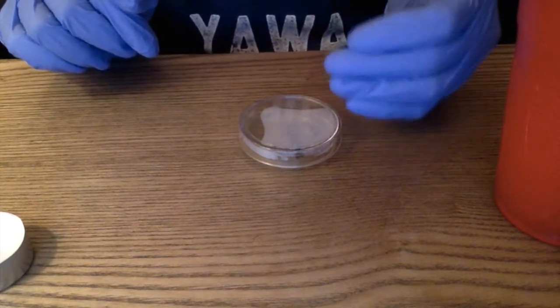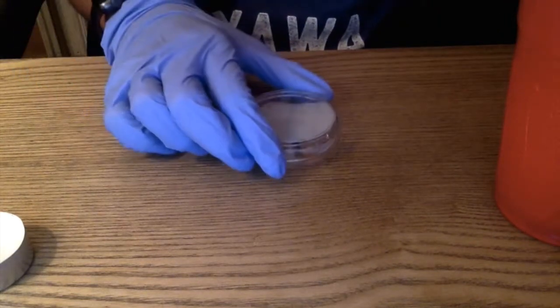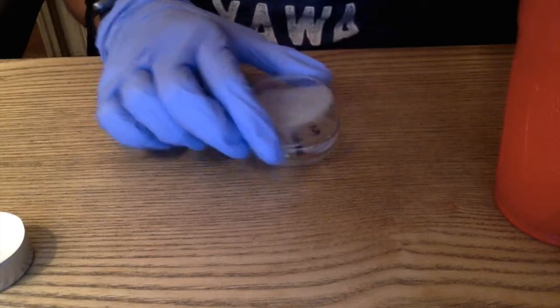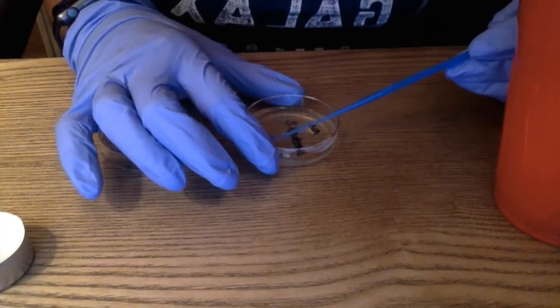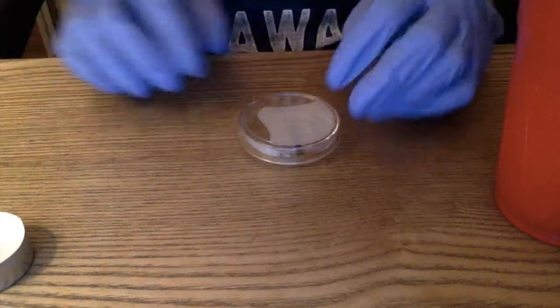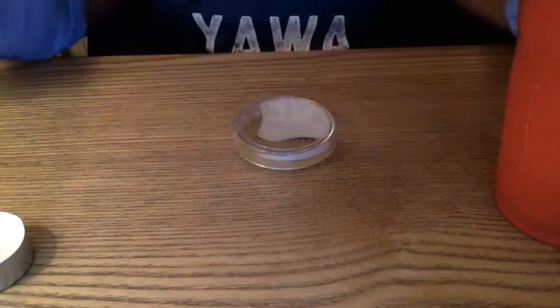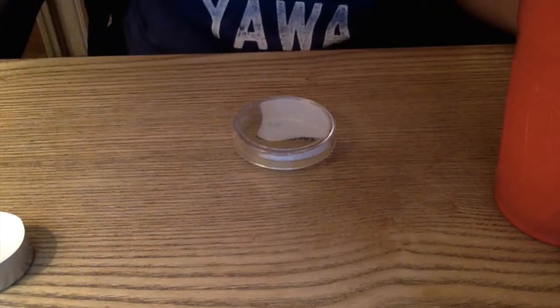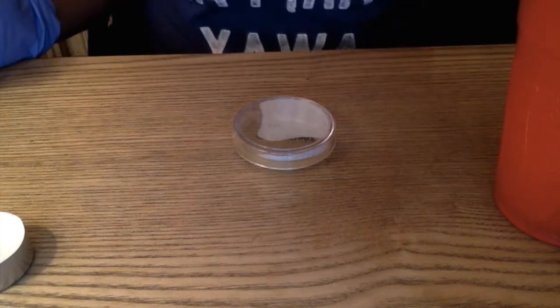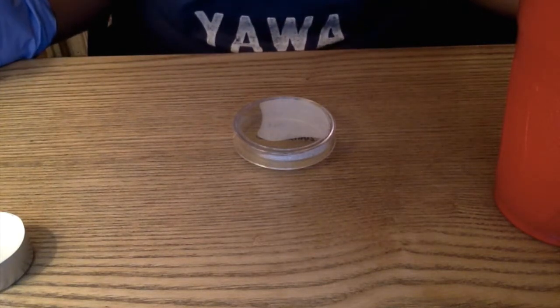So working on the adjacent one, I went ahead and did the top, I did the left, and this next one now, I'll be going from quadrant 2 into quadrant 3. There we go. Putting that lid back on, rotating it just so I don't mess up which quadrants I'm working on. Now I've already done one other broth before this video, so all I have left now is the E.